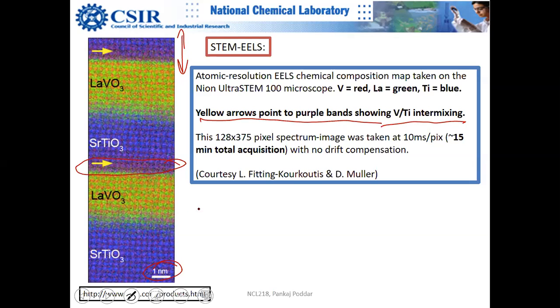Here you are detecting electrons, so that problem is not there; photon depth profiling happens at a deeper level. So the problem I was discussing earlier is solved here, because this is the depth profile, I believe.